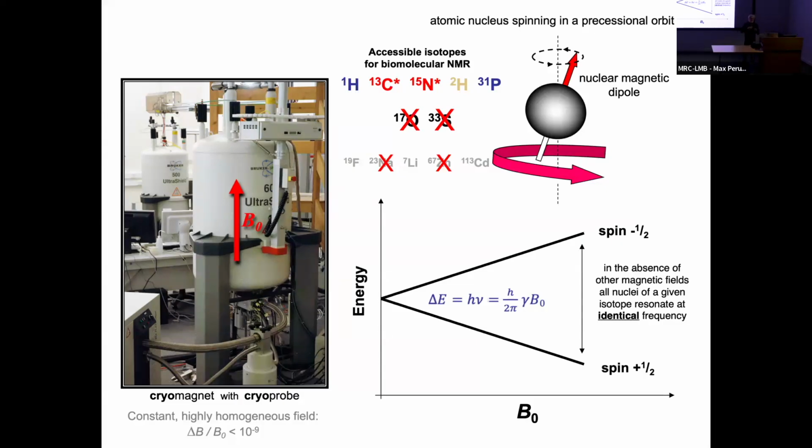The only way we can bring these into play in the NMR is, as they're stable isotopes, we can label the protein by growing it in a growth medium that contains C13 glucose as the only carbon source, and N15 ammonium chloride as the only nitrogen source. And then we have a much greater scope in which we can expand the range of observations.